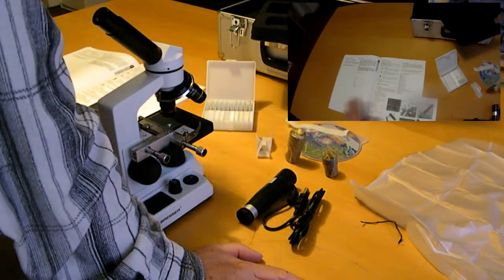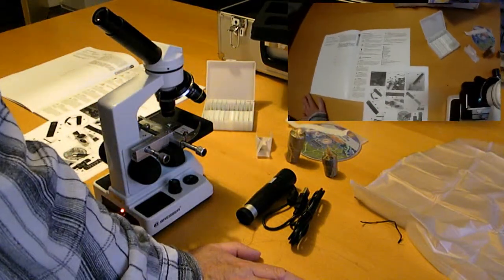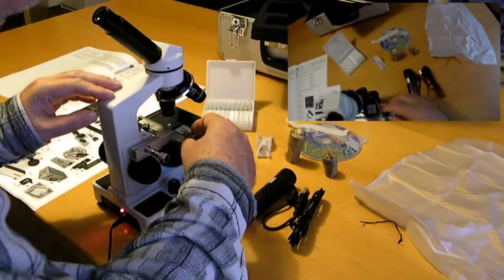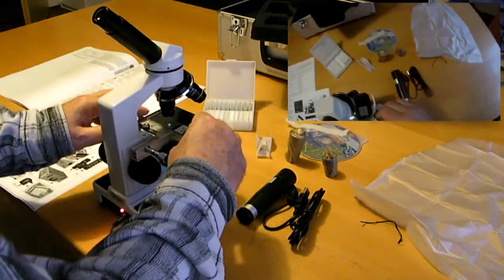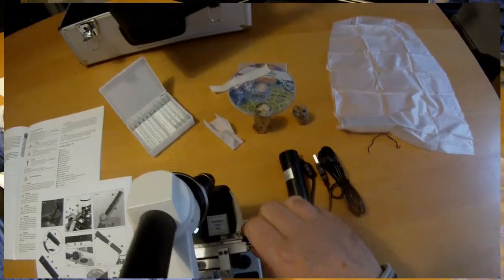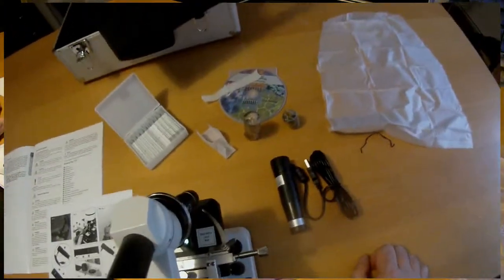Stage clips. Where are the stage clips? I have to find the stage clips. Number 18. These, I see. One, and the second here is fixed. You can open it to remove the slide with the object, and then it's fixed. It's quite strong, so the slide is really fixed here.